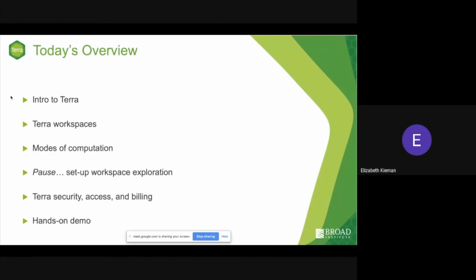So while that's happening, we'll go back to some high-level information about security, access, and billing, and then we'll go back to our web application, and we'll do a hands-on demo where we'll get to launch some computational workflows and work from some Jupyter Notebooks.